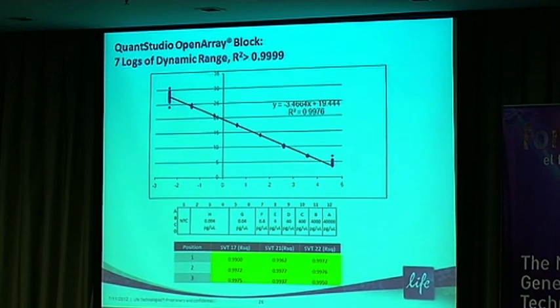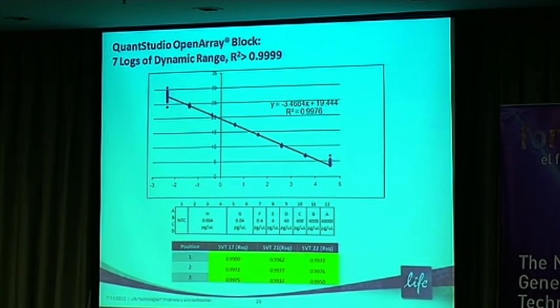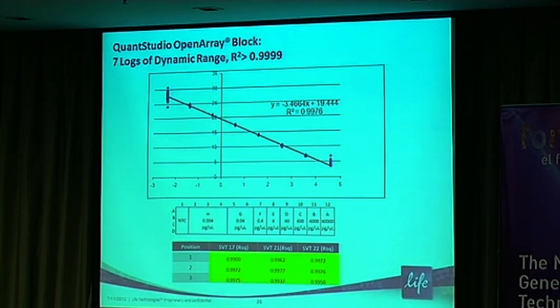While you could get very consistent CT values using a 20 microliter reaction, when you get into nanoliter reaction environments, we run into a problem that is independent of the machine itself. It's Poisson distribution. We can't control the number of copies that are reproducibly being introduced into nanoliter reactions. You might get 50 copies in there once, and then in the replicate, you're probably adding maybe 20. It's bouncing around quite a bit, and that's what you're seeing here.